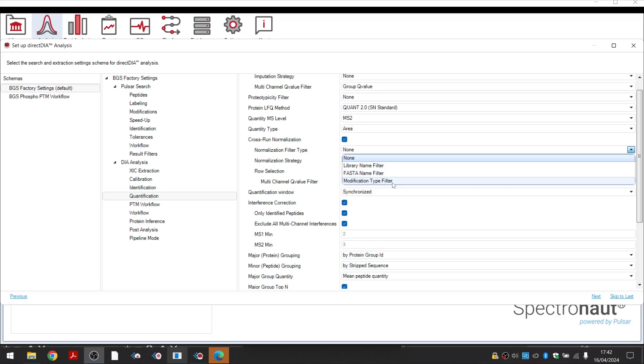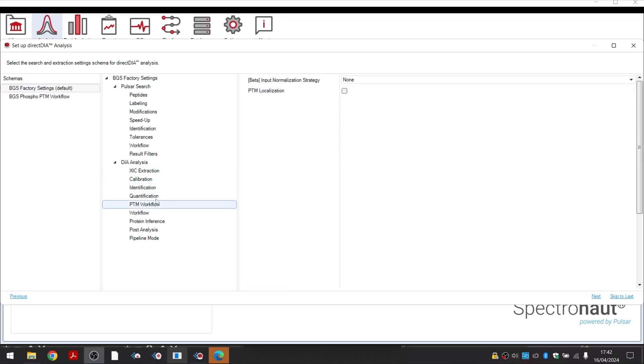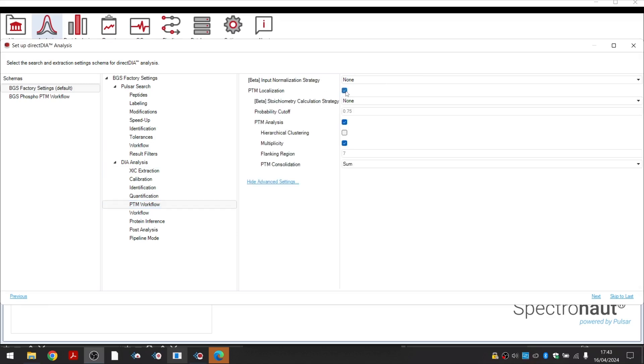For projects focused on PTM identification and localization, the PTM workflow should be enabled here. This workflow offers PTM site-level analysis with specific PTM site-level visualizations and reporting. You can learn more about this workflow by watching our dedicated PTM video tutorial.